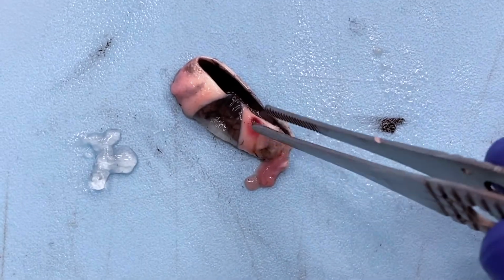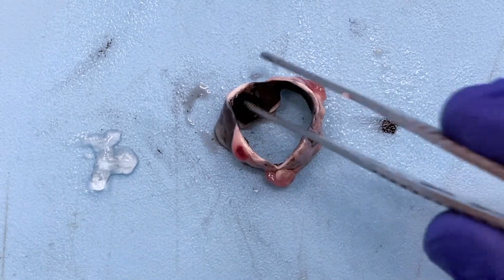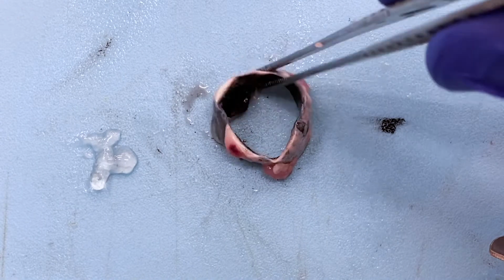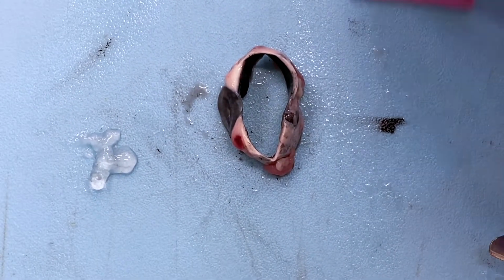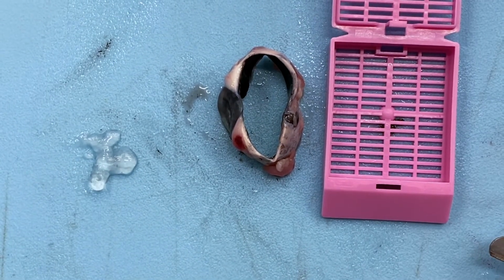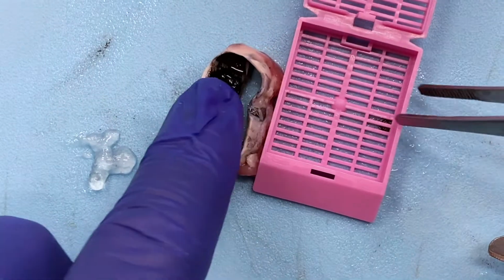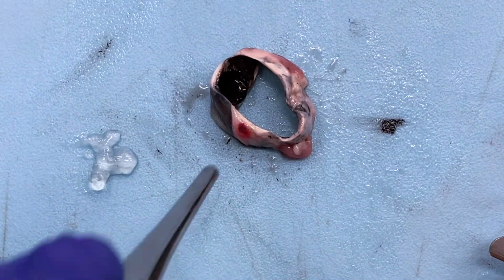Okay, so now we've cleaned it up a little bit, and we have the section we need to work with. Some places may have specialized cassettes that are bigger and wider and thicker, and they can handle a section like this. But not us. We're still going to use the standard cassettes here. So we want to make sure that we fit that properly in here. As it stands, it's a little too thick. You can hopefully see. So I'm going to trim it down. And there's nothing wrong with that.